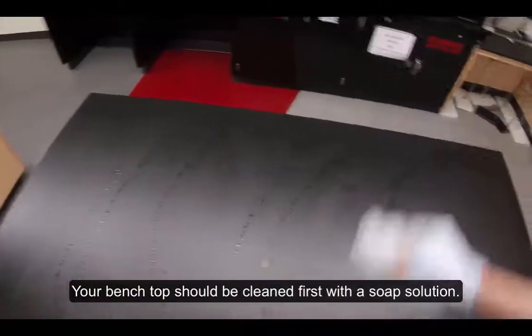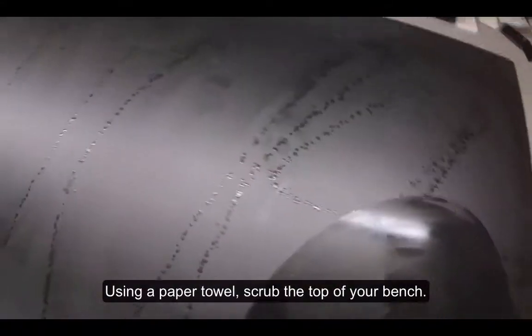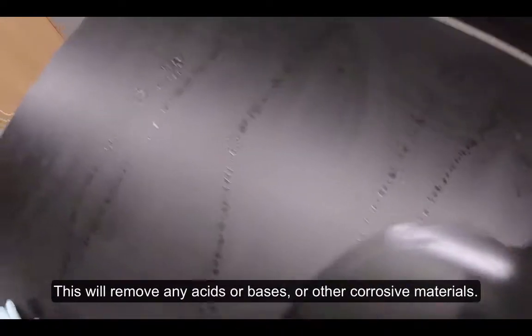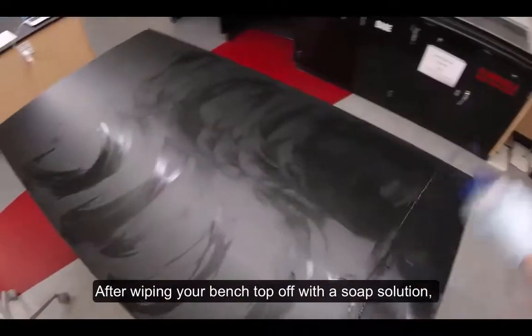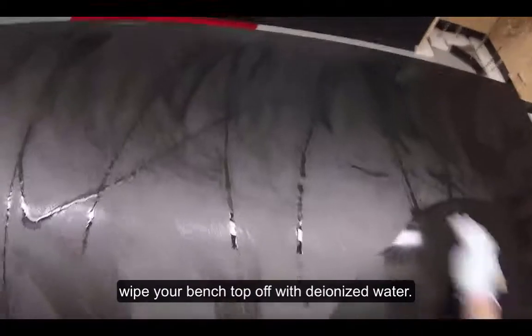Your bench top should be cleaned first with a soap solution. Using a paper towel, scrub the top of your bench. This will remove any acids, bases, or other corrosive materials. After wiping your bench top off with a soap solution, wipe your bench top off with deionized water.